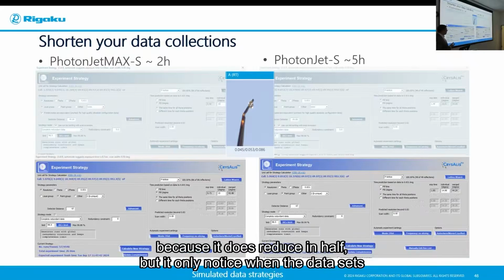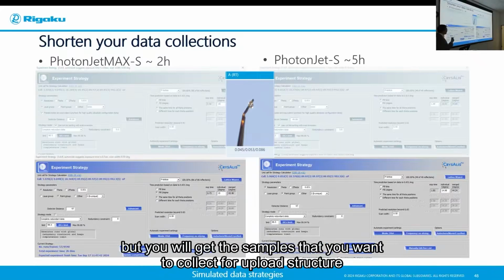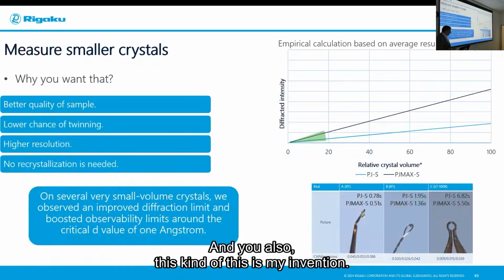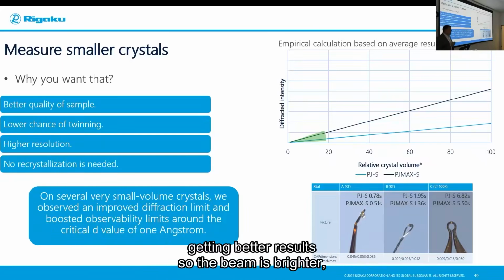microfocus system, because it reduces the time in half, but you only notice it when the data sets are getting longer. So if you're talking 10 minutes versus 5 minutes, but you will get samples that you want to collect for absolute structure, and then it will be 2 hours. So that's the thing that you can see. And this is my invention, so it's not really accurate, but I made an Excel sheet correlation, and I really can show that smaller crystals are getting better results.